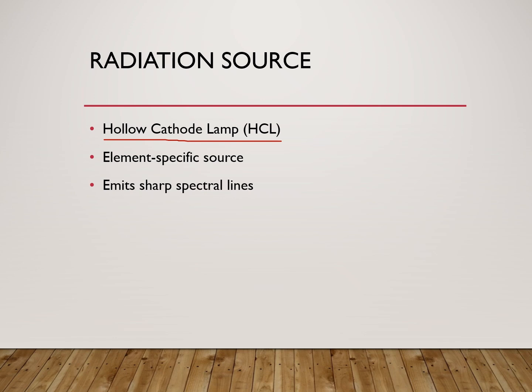So the radiation source is an element-specific source. In this case, which element is to be analyzed?